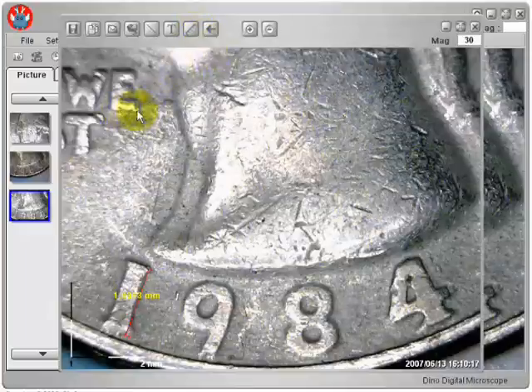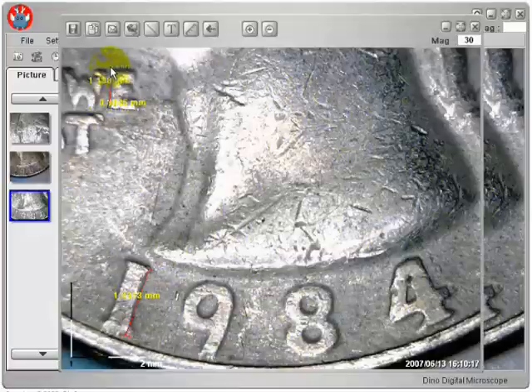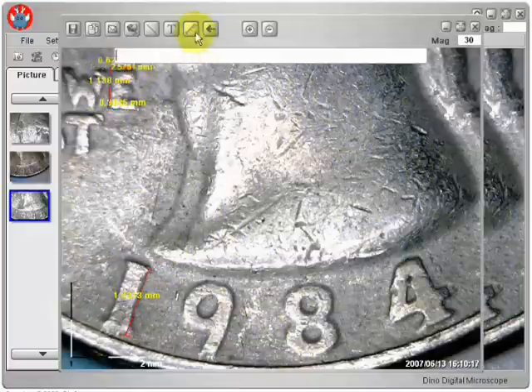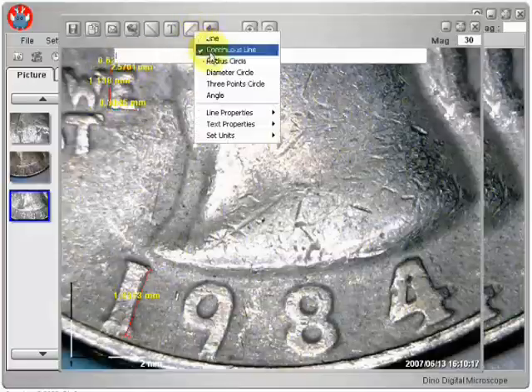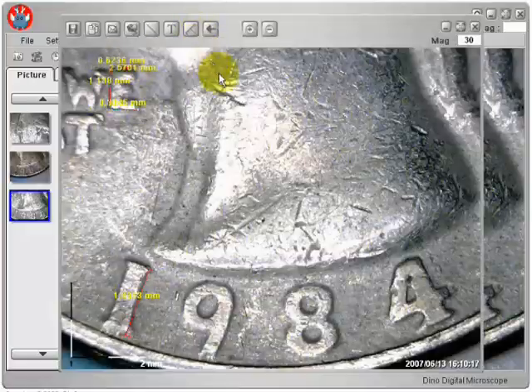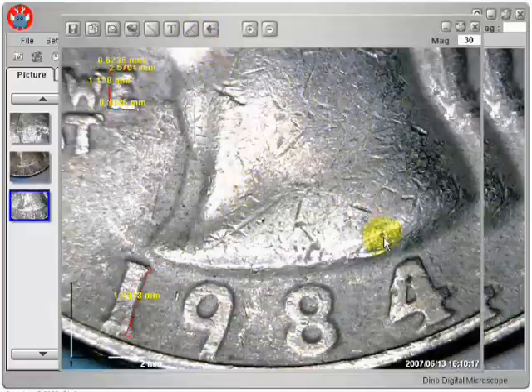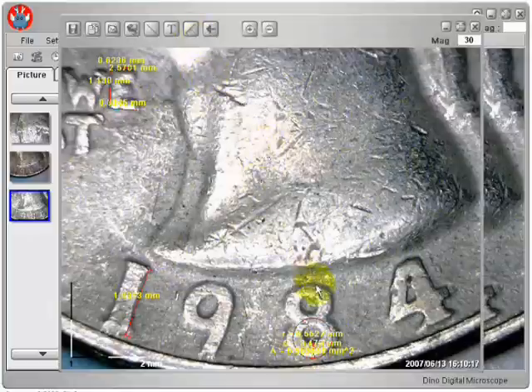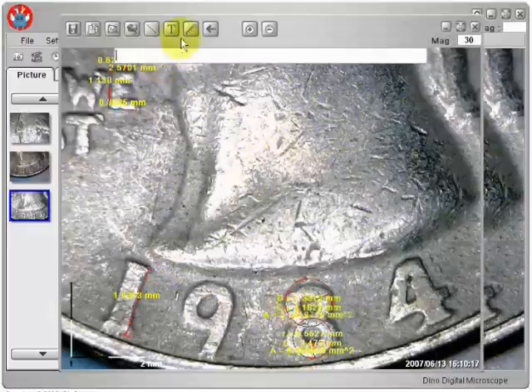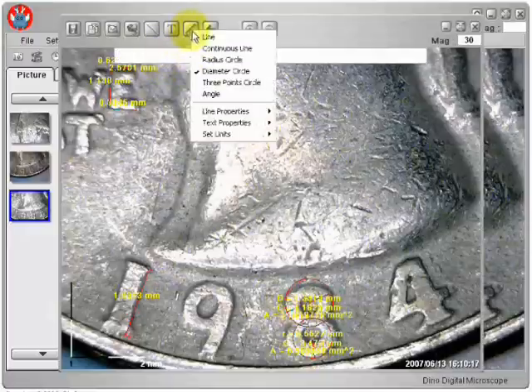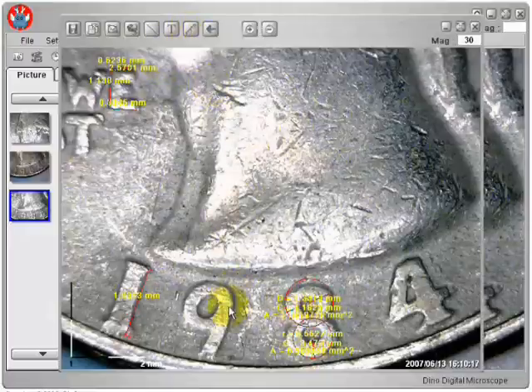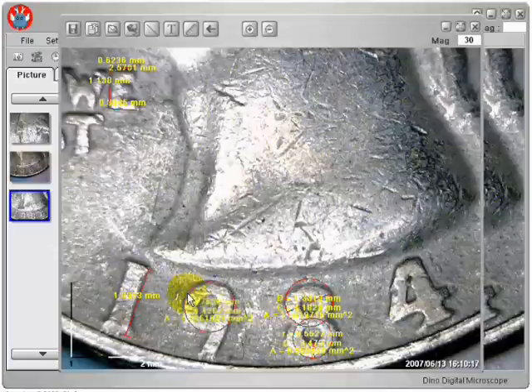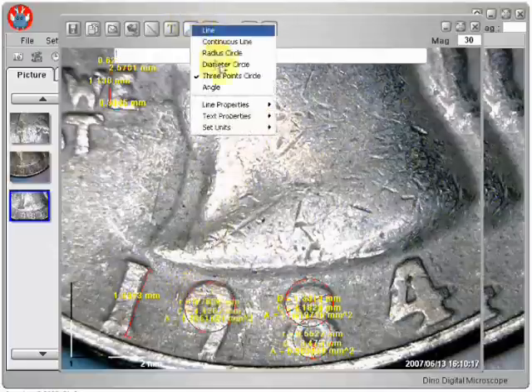measure lines continuously, measure a circle from drawing the radius, measure a circle from drawing the diameter, measure a circle from the width of a circle, and draw an angle.